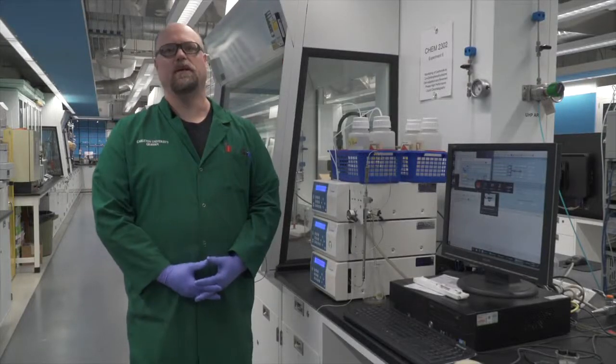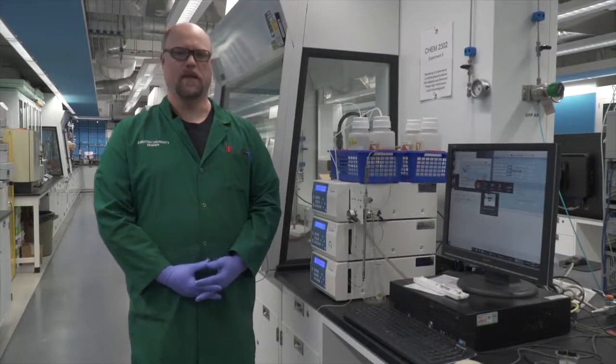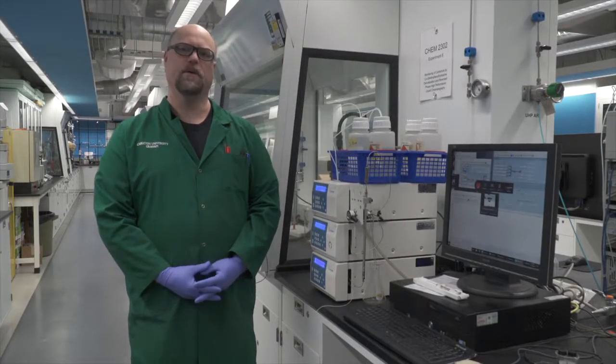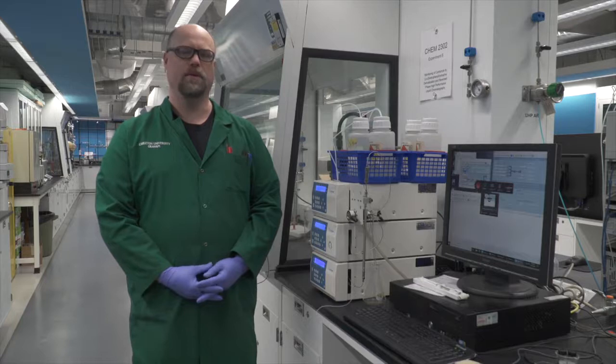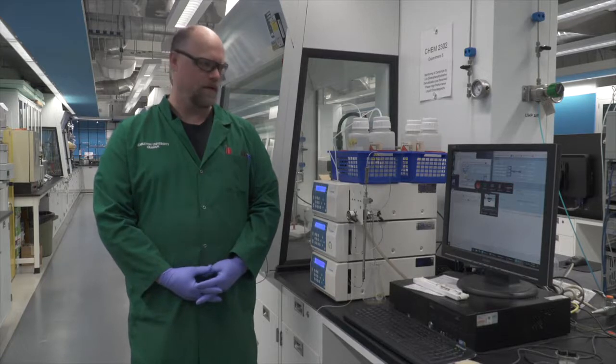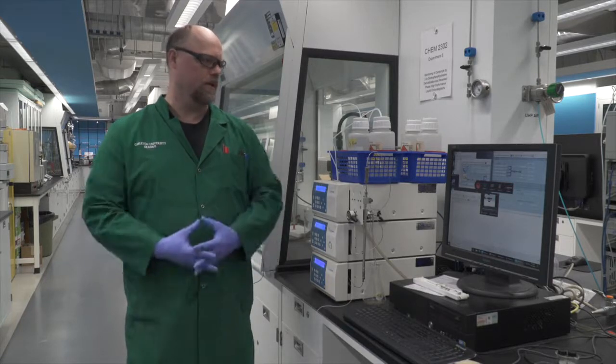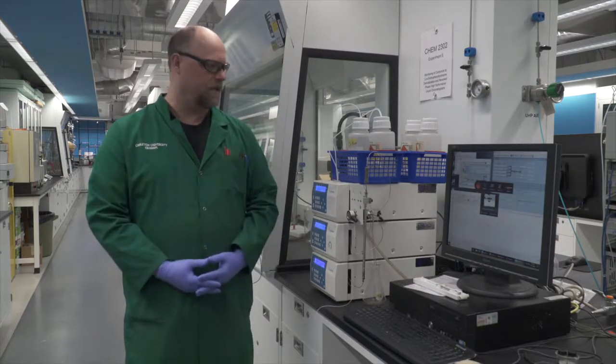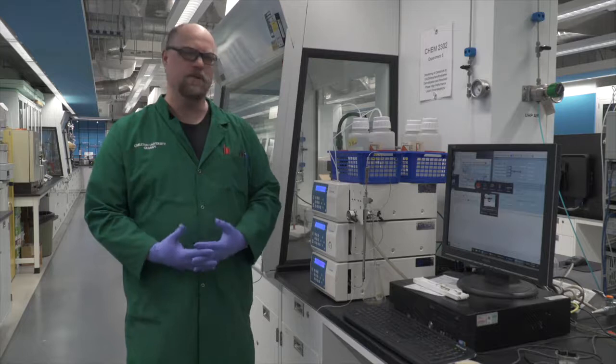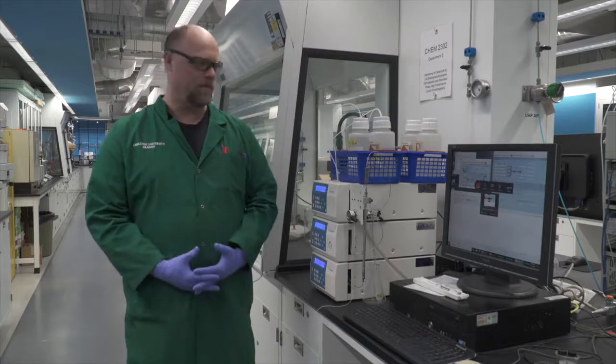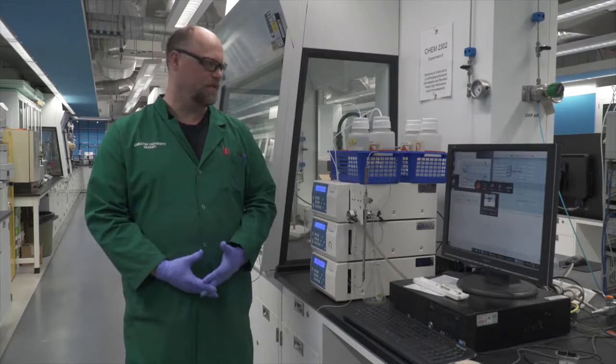Welcome, my name is Graham Galloway. I'm the Chemistry Lab Coordinator for CHEM 2302 and 2303. Today we're here to look at the HPLC instrument that you'll be using in this lab for a couple of different experiments.